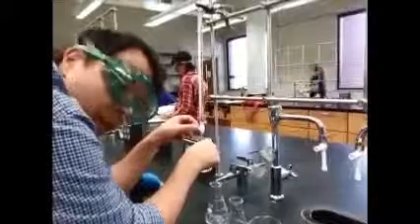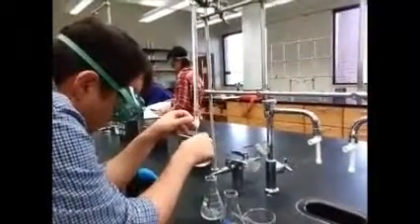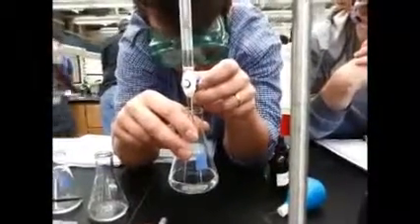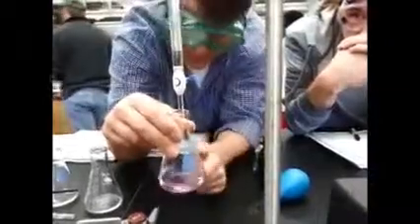Here we're going to add the standard solution until we see the indicator turn colors. Once the solution starts to stay pink for several seconds, it's important to begin letting the sodium hydroxide through drop by drop so that you do not go past the end point. Once the solution has reached a consistent light pink, we know that the endpoint has been reached.